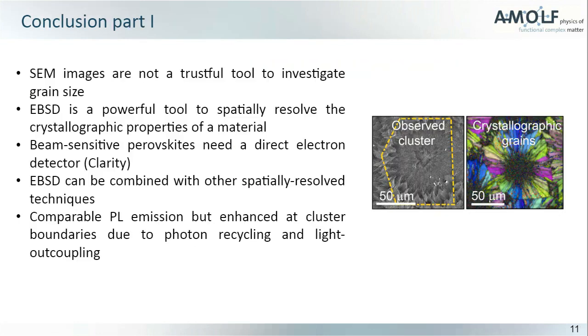So, just to conclude, the main message of my talk is that perovskites are very sensitive materials that have to be measured also with a very sensitive tool, as for example the EBSD with this Clarity detector. But then we should also not trust too much the SEM image for these grains, because most of the time the real crystallographic grains are different than the grains that we observe in the SEM.